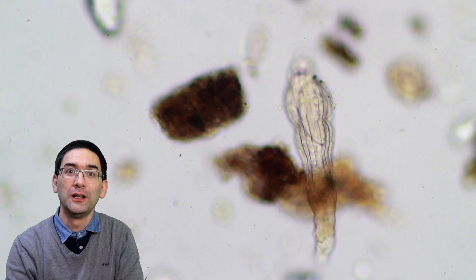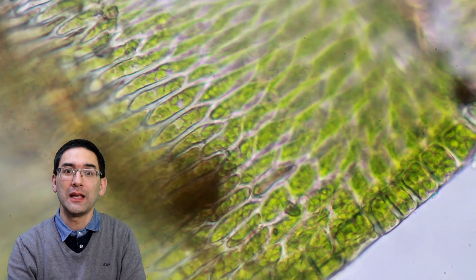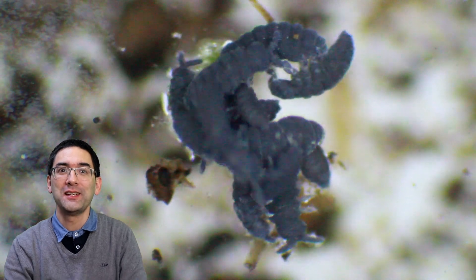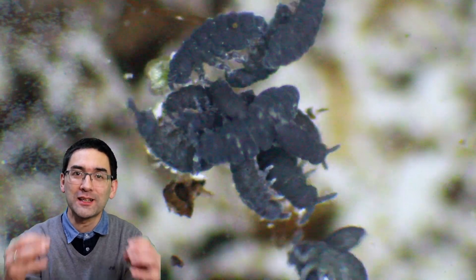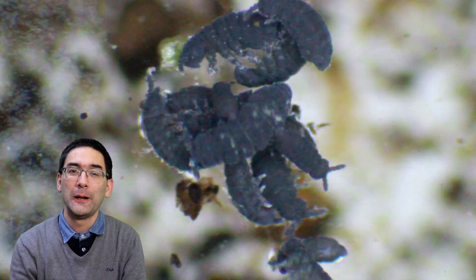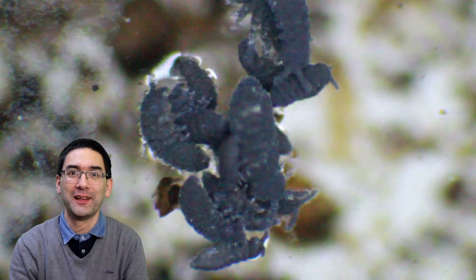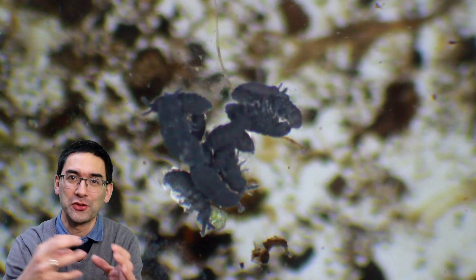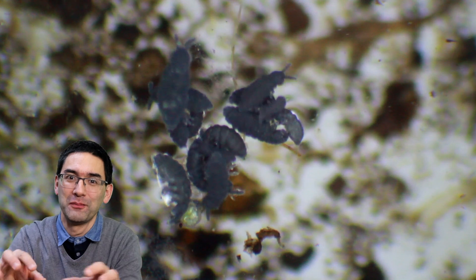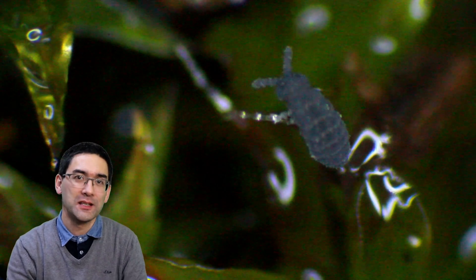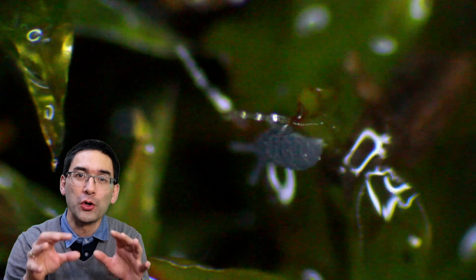This here is a rotifer. I put a moss leaf directly under the microscope and the individual cells were visible. As you can see, I've got a rather wild collection of different specimens. It was quite fascinating to see all the small insects clustered together on the surface of the water. They did not sink because of surface tension, but they were evidently trying to hold on to something, and what they found was just each other. That's why they were clustered together and drifting around on the surface.